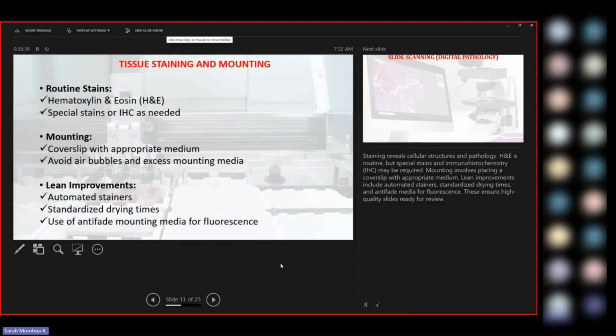For us being the technical people, when we are doing the staining, you know which cell to pick, which part of the cell to pick, which part of the stain. And that you can check microscopically once you're done with the staining. The next, not the last, step we are doing is mounting. There are many mountants in the market, but you can use DPX. Even the aqua mountant, I saw it is still in the market, but you can use DPX if you do not have the aqua mountant. Here you're using a cover slip. Histopathology cover slips are usually bigger than the normal cover slips. If you do not have them, you can use the normal cover slip, but depending on the size of the tissue on the slide, use 1 or 2 cover slips.